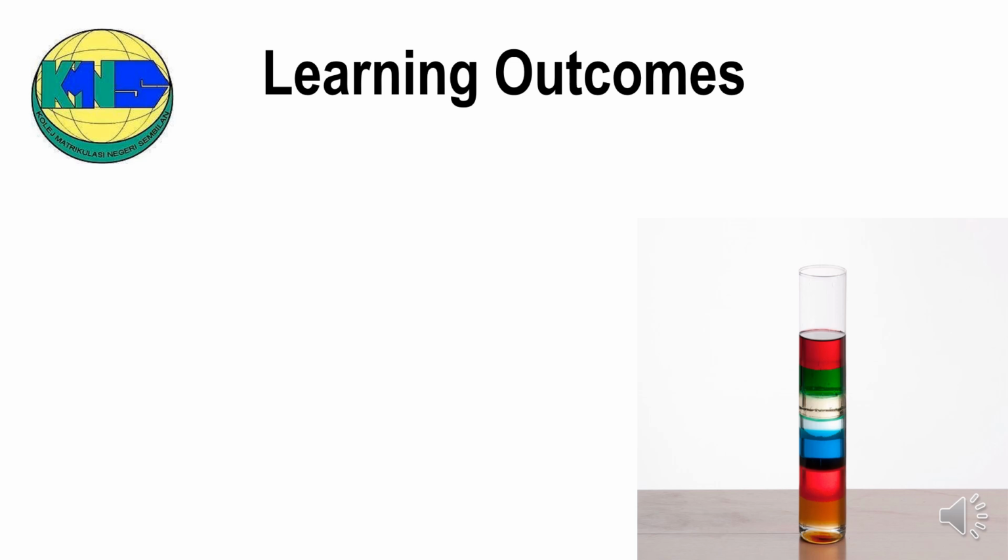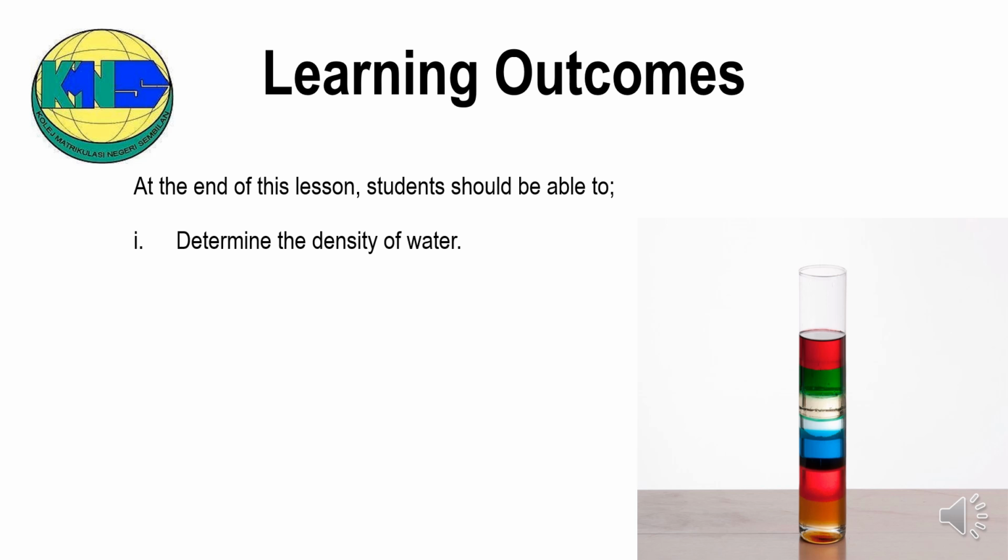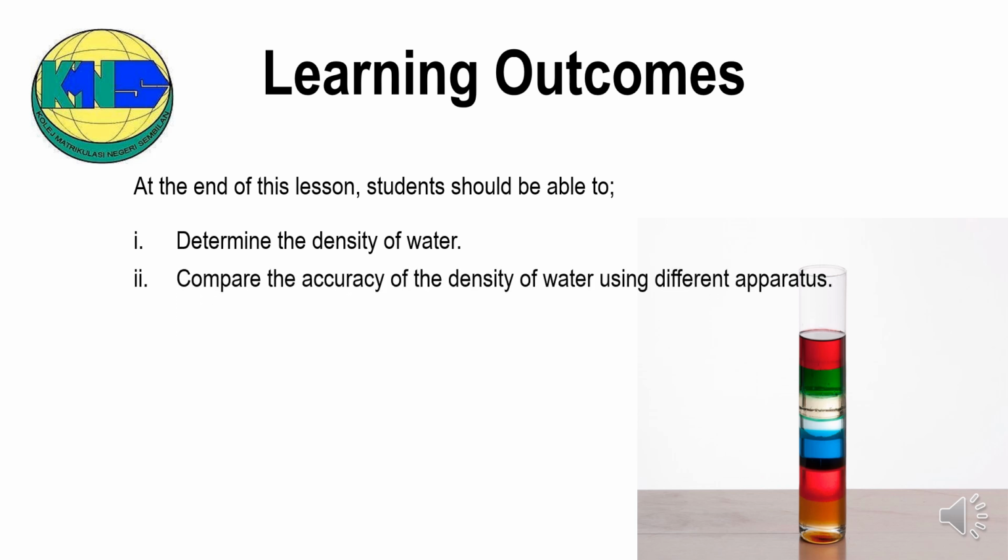Learning outcomes. At the end of this lesson, students should be able to determine the density of water and compare the accuracy of the density of water using different apparatus.